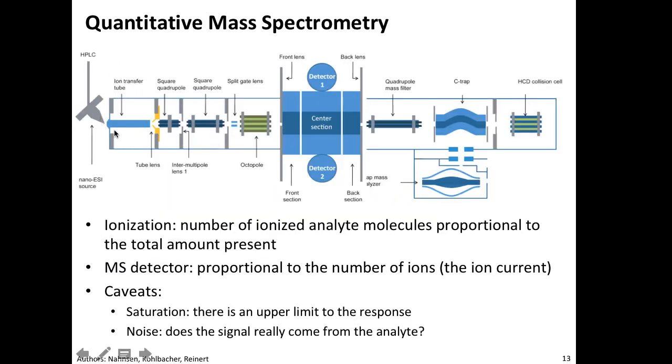We have an ion source. So in order to determine the amount, everything that is in our sample, in our volume, needs to be ionized. That's not going to happen. So we lose some of that quantity already in the ionization. That's the ionization efficiency. Not everything that goes into this spray will actually end up being ionized.